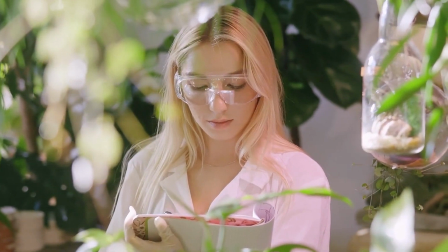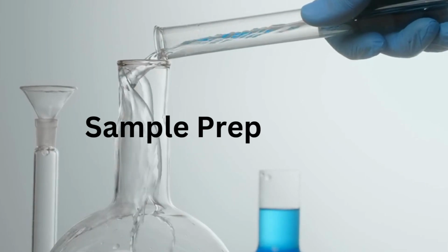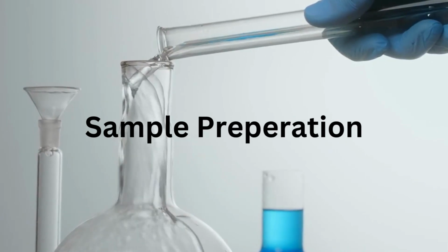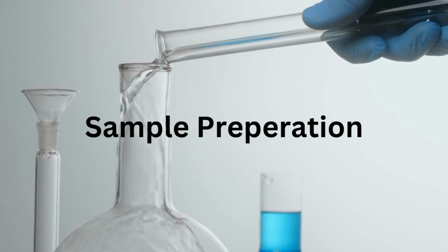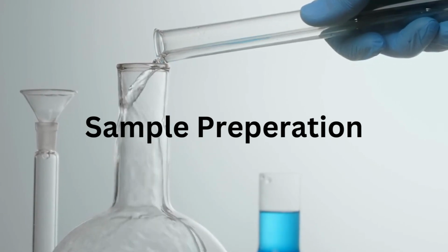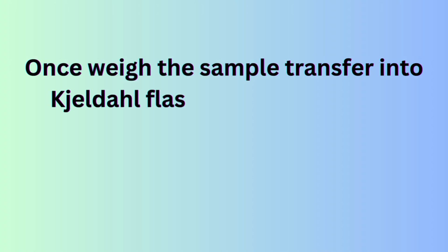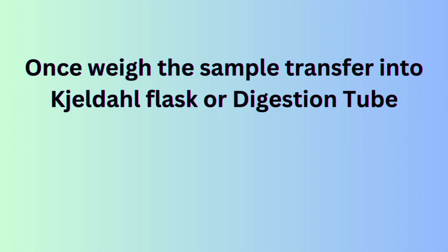But before we start, remember to always wear appropriate personal protective equipment, such as lab coats, gloves, and safety goggles, when working with chemicals. The sample preparation. Begin by accurately weighing your organic sample. The sample size depends on the expected nitrogen content and the sensitivity of your analysis. Once you've weighed the sample, transfer it into a Kjeldahl flask.